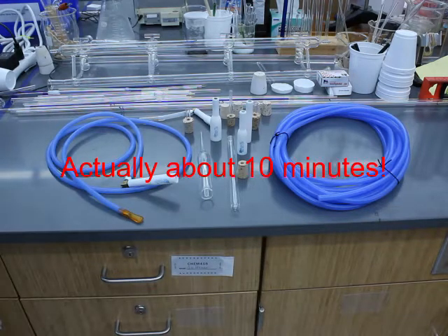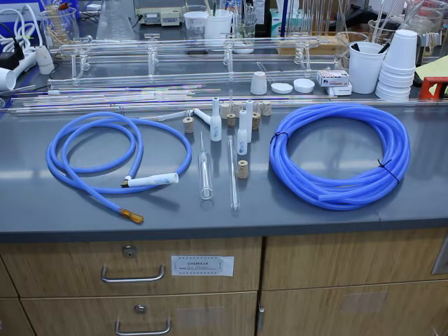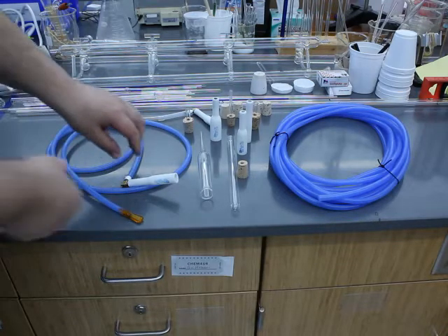This will be a very brief video on equipment that is used for scientific glassblowing, specifically the blow hose and adapters that are used with it.